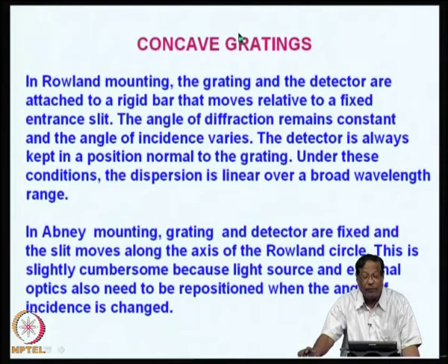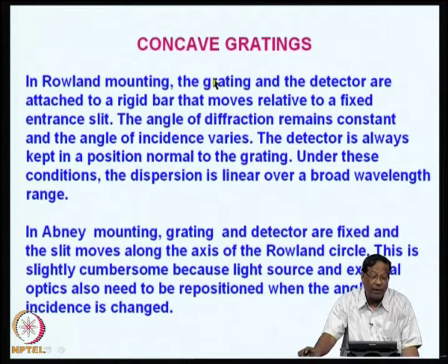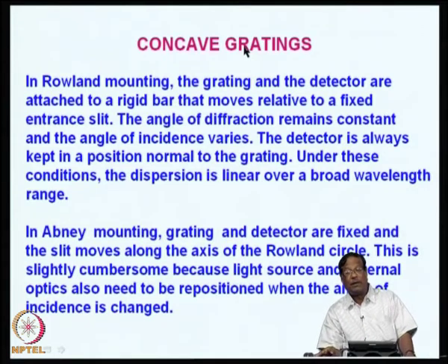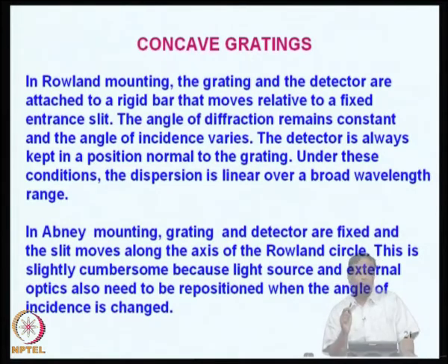Now, you can use concave gratings. In concave gratings, the requirement with respect to atomic emission is that you need to determine a number of elements without a specific element source.